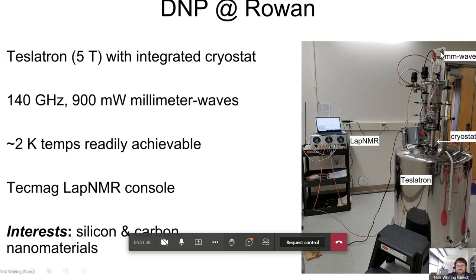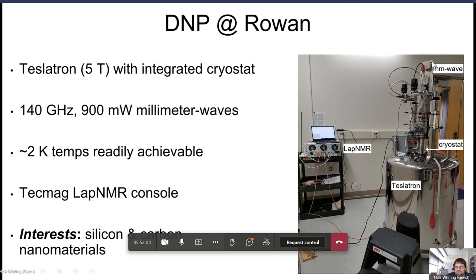And then all of this up here is a 7.8 gigahertz microwave source, or millimeter wave source, that goes into a frequency multiplier and amplifier that multiplies it out to 140 gigahertz. Then it feeds in a waveguide down into the cryostat. There's also a coax cable for a built-in coil. You take off a few clamps and this whole thing, from up here down to here, pulls out of the magnet. It's probably about 3.5 feet long, and that's where the probe, the microwave source, the temperature sensors and all of that stuff feed in through the top.